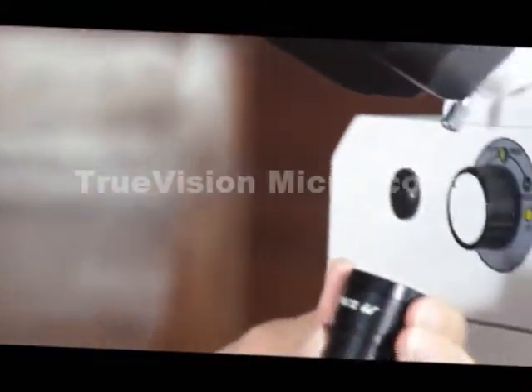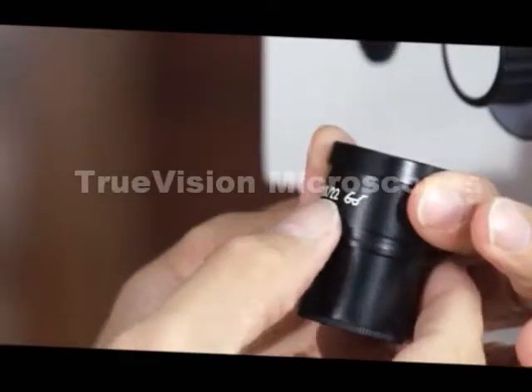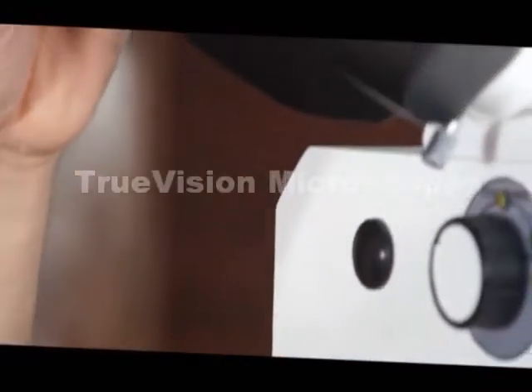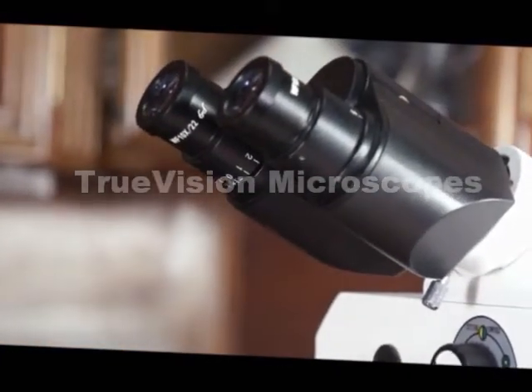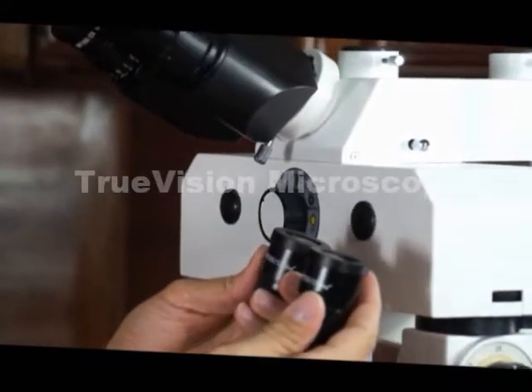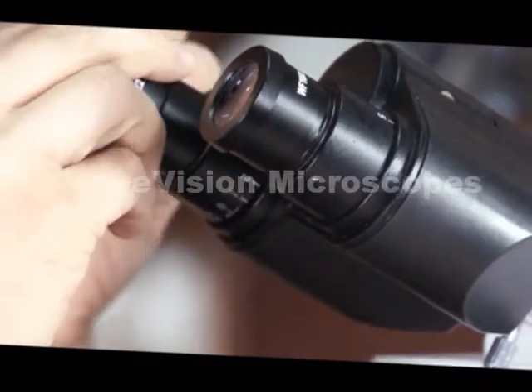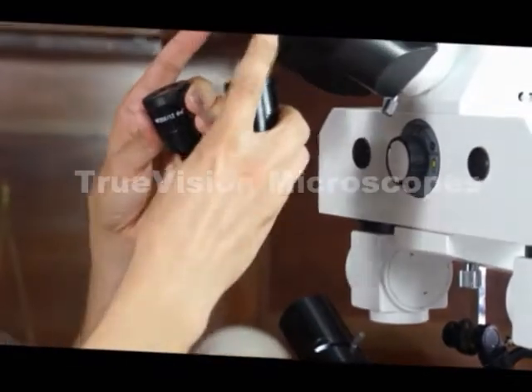This microscope comes with a wide-field 10x eyepiece. The 22 refers to the field width — that's a 22mm field width. The eyeglass symbol indicates a high eye point, so someone wearing eyeglasses can use this without having to remove them. The microscope also comes with a pair of 20x oculars, which are very simple to remove and replace. The 20x eyepieces will double your magnification versus the 10x eyepieces.